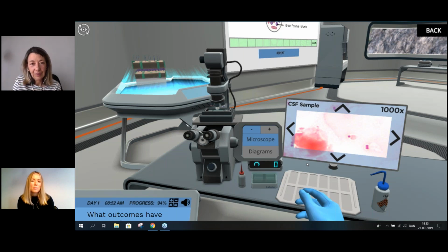Let's say we run this as a pre-lab activity and we see, oh, everybody got stuck at this point, let's say calculating the CFU, so we can go back and do some extra work, little discussions and practice on how to make those calculations. So it's going to give us a more granular view of what the problems are, what are the concepts that students have difficulty with.